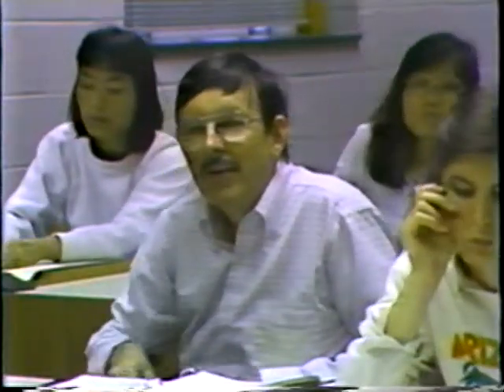So is COSY itself a good experiment to do? There have been so many attempts made to improve COSY. All of them work, but COSY still is the first experiment and perhaps the most informative experiment. Somebody may disagree with me, but I would say you can't perhaps do away with the COSY.